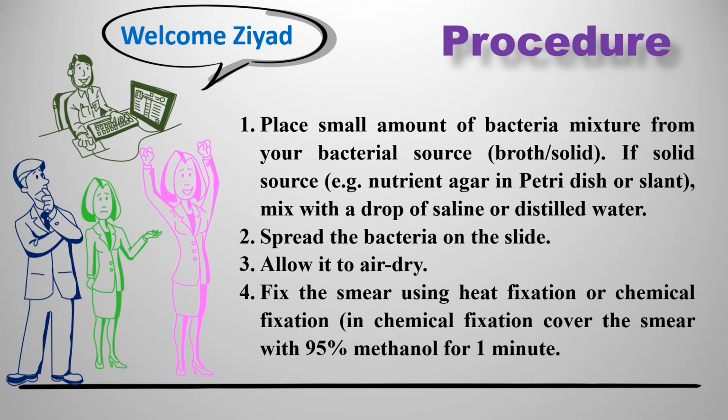When you finish all this, fix the smear using heat fixation. That means you move your slide for some time just above the heat source. Do not heat it until it burns. Or you can also use chemical fixation. That means you take your smear and cover it with 95% methanol for 1 minute.